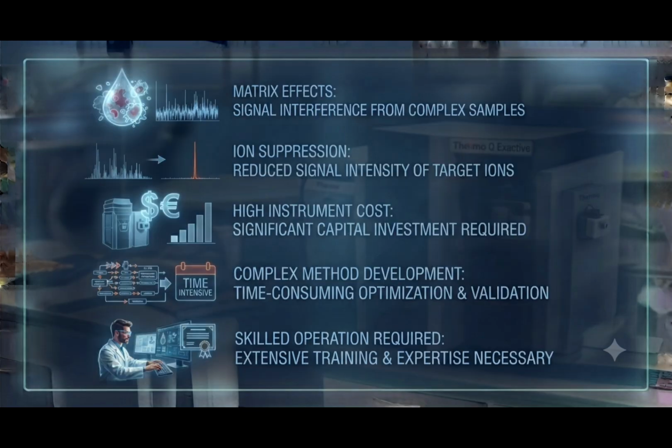Limitations. However, mass spectrometry also has certain limitations. Matrix effects can cause ion suppression or ion enhancement. The instrument can be expensive and require regular maintenance. Method development may be complex. Proper sample preparation, chromatographic separation, instrument optimization, and data interpretation are important for obtaining reliable results.